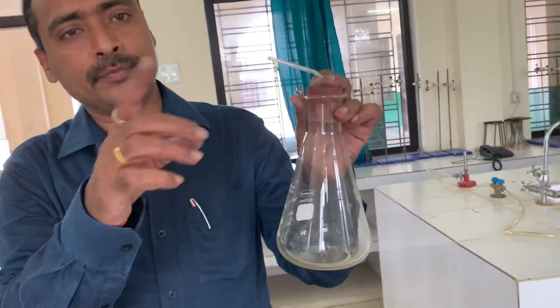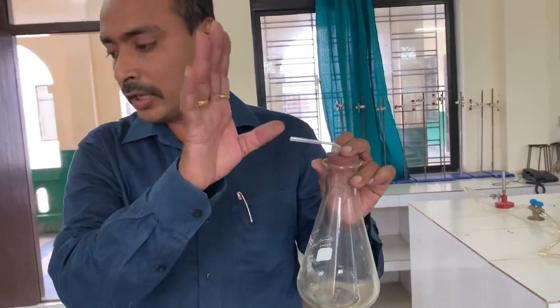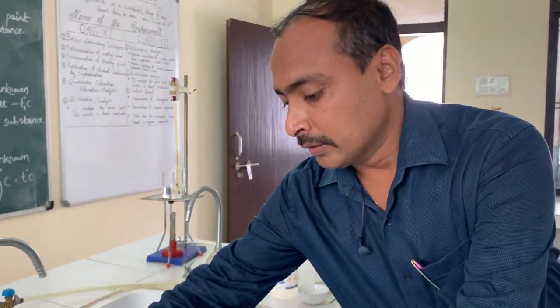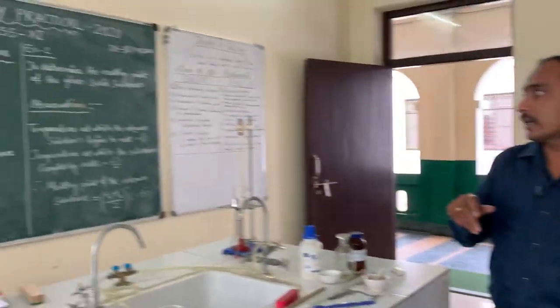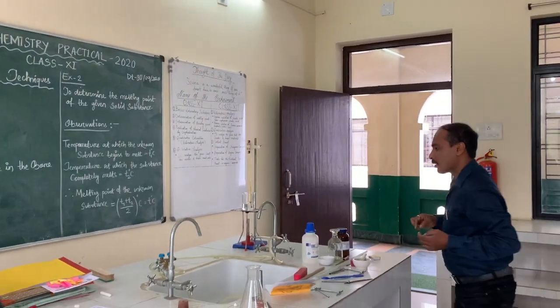Only gas can be coming from the conical flask; the solution remains inside the conical flask. So this is the use of the delivery tube and cork. This is all our experiment number one: cutting glass tube and glass rod, bending of glass tube, drawing a glass jet, and boring a cork.